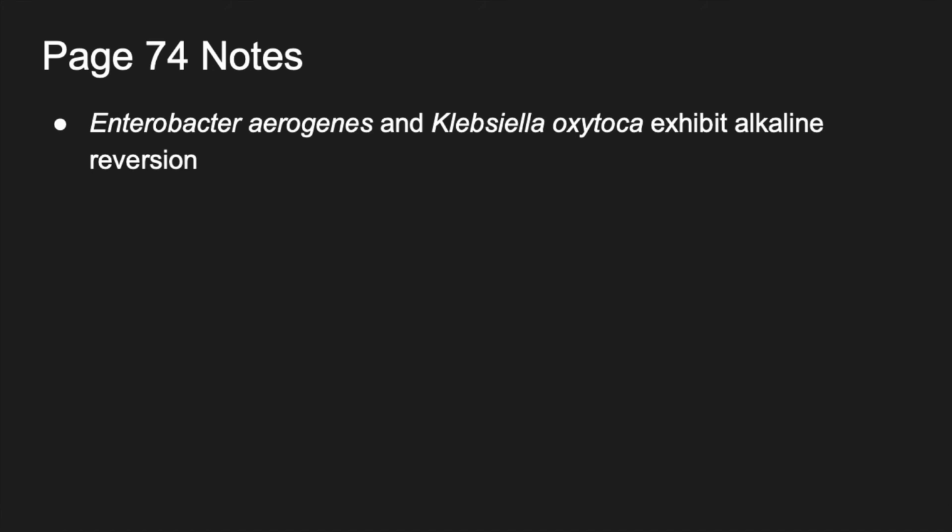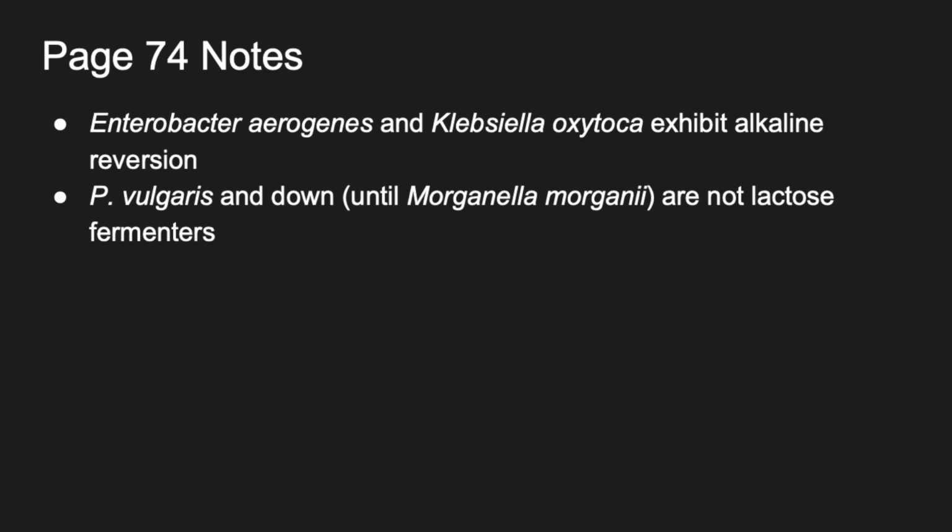It's earlier in this lecture what alkaline reversion means. And then in your table on page 74, from Proteus vulgaris down to Morganella morganii, just write a note that these are not lactose fermenters. They cannot ferment lactose. That's just important to know.